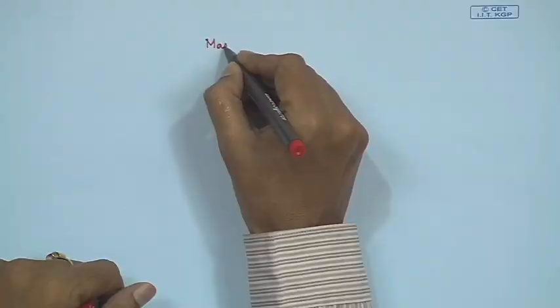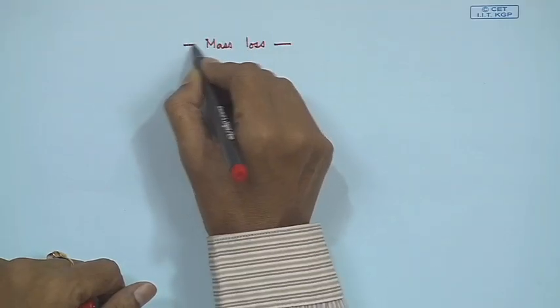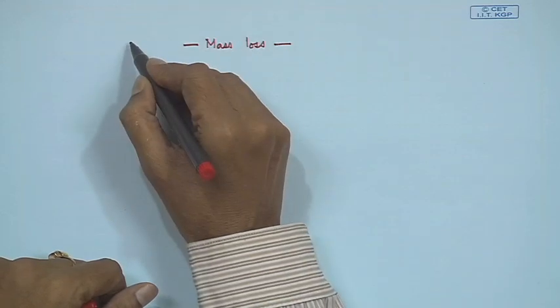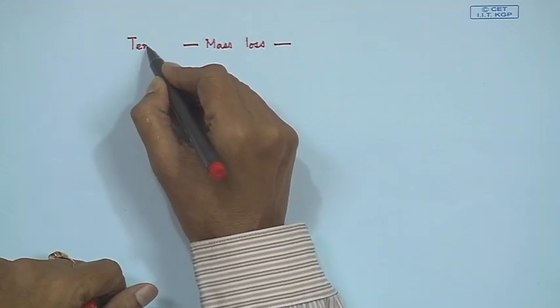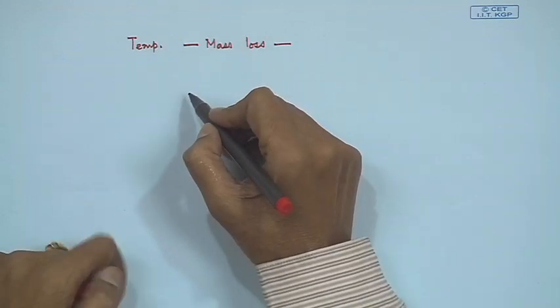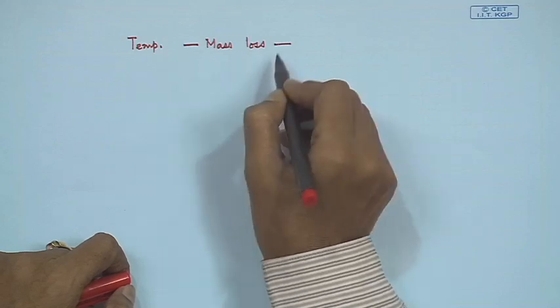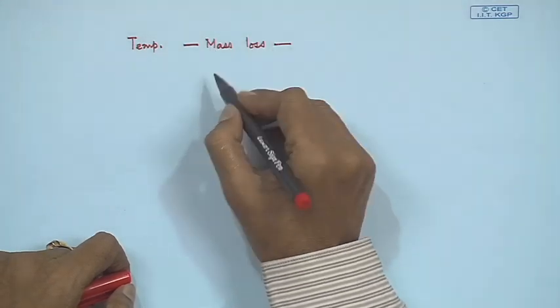Hello, welcome to this class of thermoanalytical methods, where we are talking about a simple thing, which was the mass loss. We are trying to monitor this mass loss with respect to temperature increase, and that is a very simple and straightforward way of knowing how stable the compound or the material is.